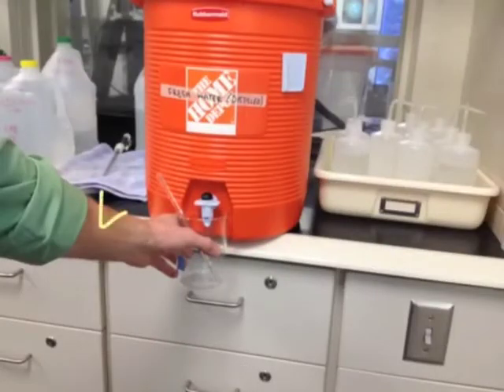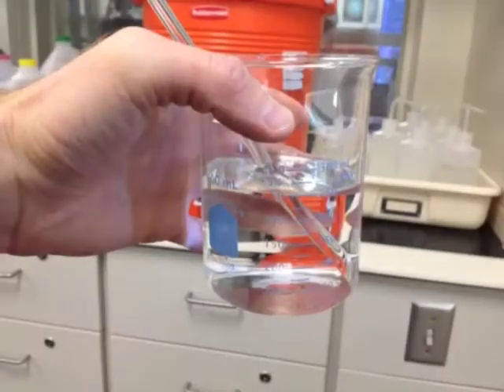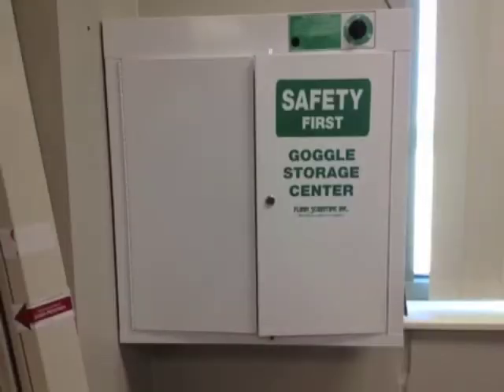Take a 400 mL beaker and fill it up with 250 mL of distilled water. Here you can see 250 mL of water in the 400 mL beaker. We're going to be using vinegar acid, so make sure to wear goggles for this experiment.